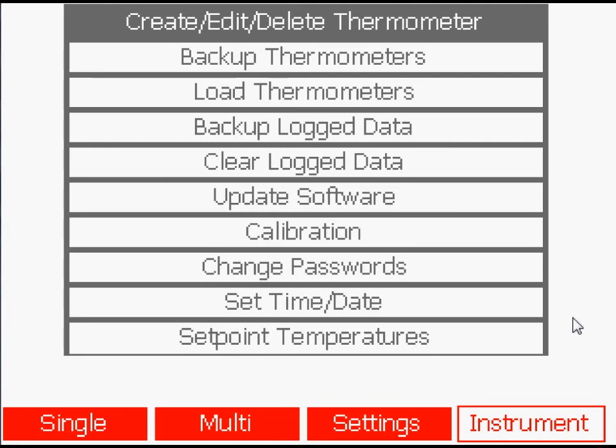Perform maintenance tasks such as backing up, clearing or restoring data stored in internal memory, updating software and calibrating your Millicay.